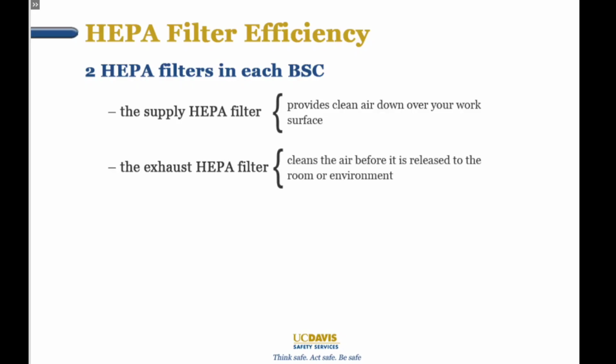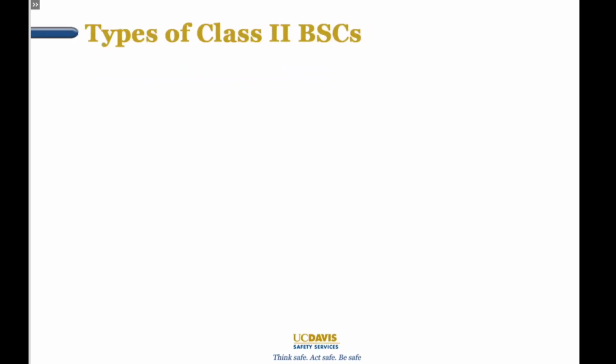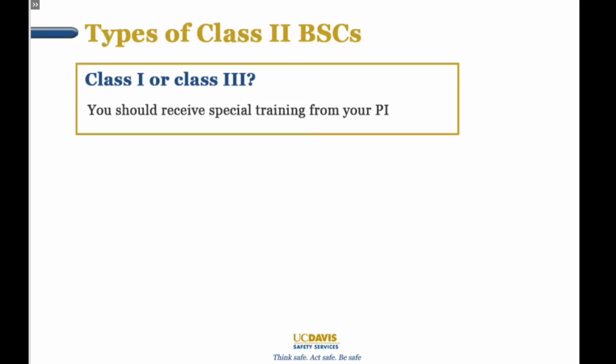We will now talk more about BSCs themselves. There are three classes of BSCs. However, the most commonly used is the Class 2, which is what will be discussed here. If you use a Class 1 or Class 3 BSC, you should receive special training from your PI.